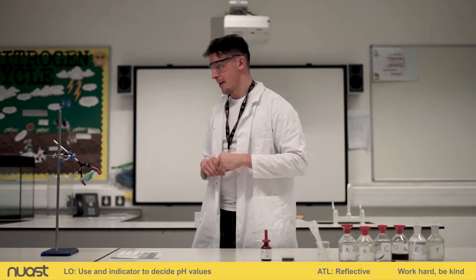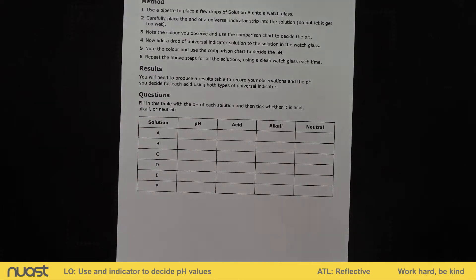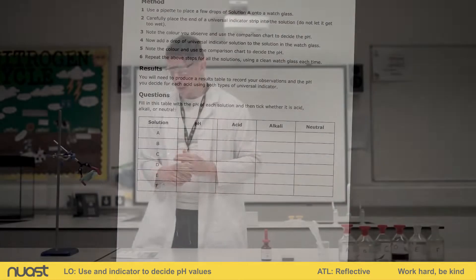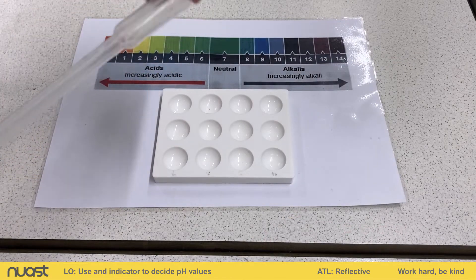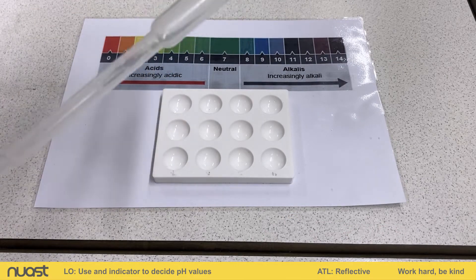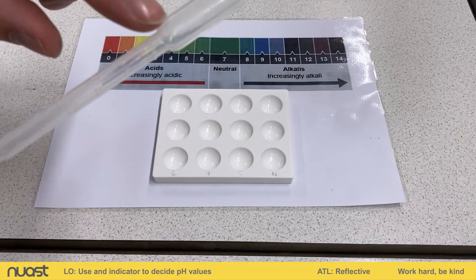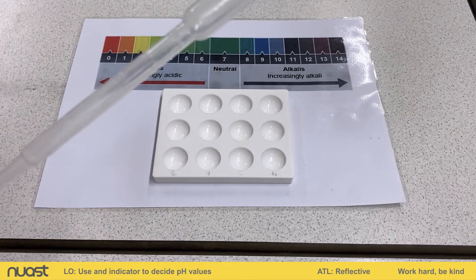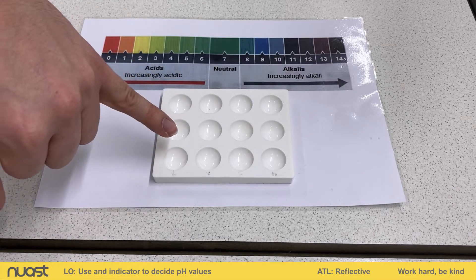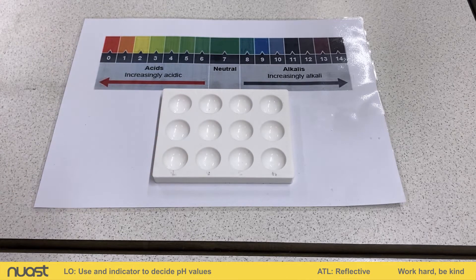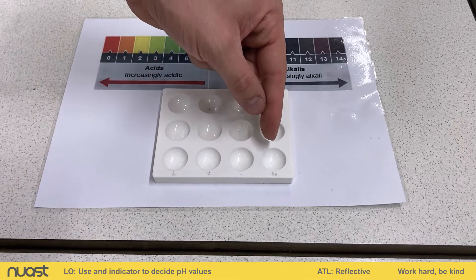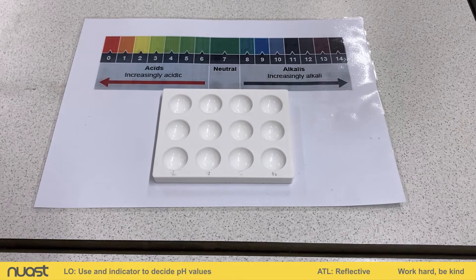Let's have a look at the method. The method says to use a pipette to place a few drops of solution onto a watch glass. We have our dropping pipette here — you are able to measure volumes since it's graduated along the side, but it isn't very accurate. Instead of using a watch glass, we're going to be using a dropping tile so that we can compare the different solutions.